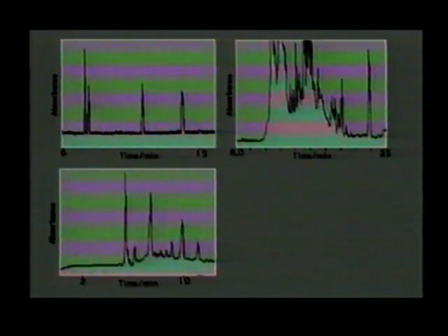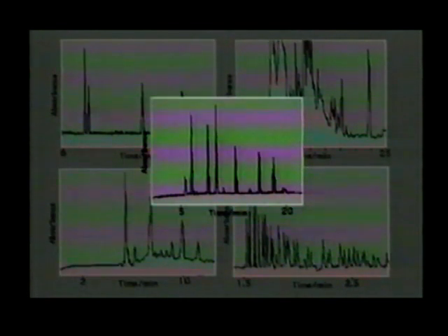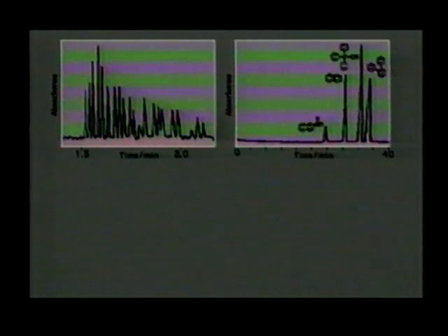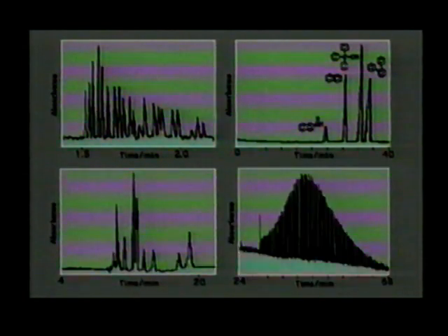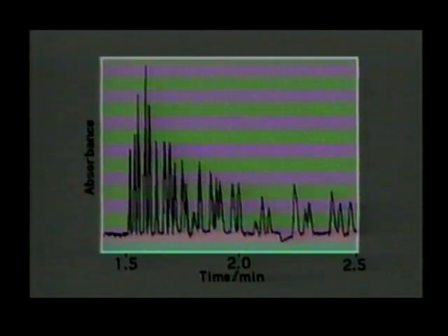Capillary electrophoresis already has valuable applications in key industrial sectors, for example, specialty chemicals, pharmaceuticals, biotechnology, the water industry, and food science. Successful separations of inorganic ions, organic molecules, proteins, polynucleotides, and polysaccharides have all been reported.